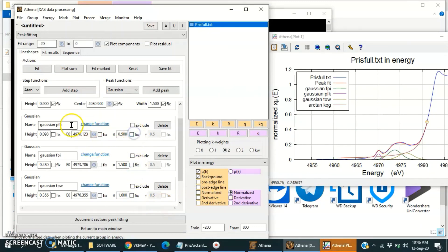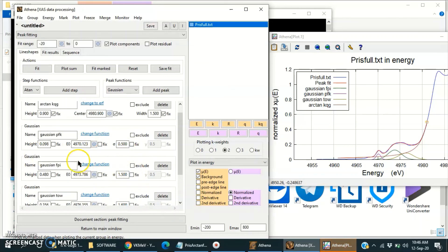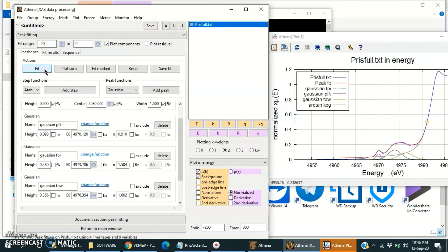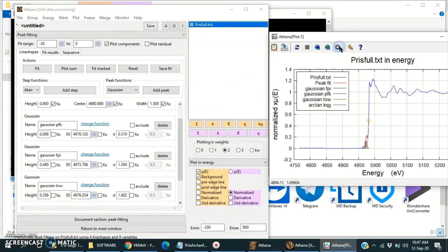Now unfix them — all are unfixed. The fitted parameters will have an error as well. If we fix them then we will not get any kind of error. I think the fit is quite acceptable.